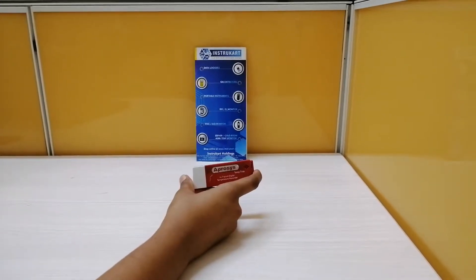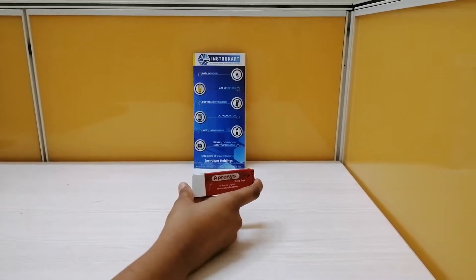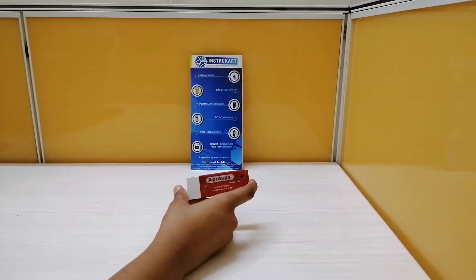Hello all, welcome to Instrocart Holdings, your worldwide instrument partner. Now I am going to walk you through the product Apresys USB Temperature Data Logger.